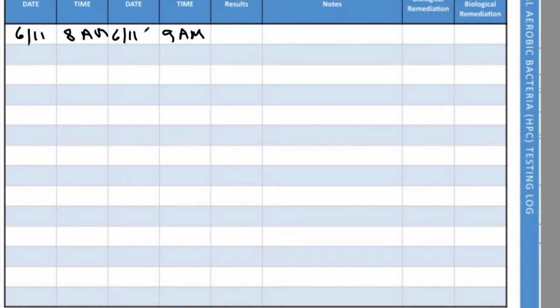the level represents. Okay, so now we might wind up with a result, and these results are in orders of magnitude: 1,000, 10,000, 100,000, a million. If you get 10,000 or less, you're in pretty good shape in terms of the bacterial levels in cooling towers. Remember, this is not drinking water that we're dealing with.